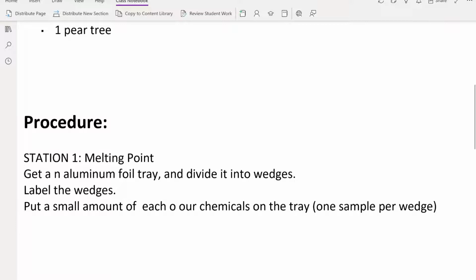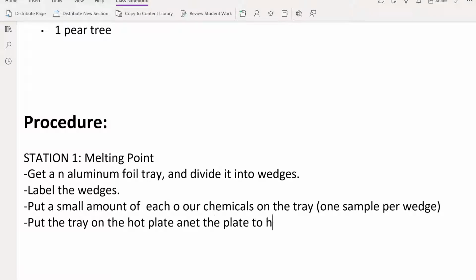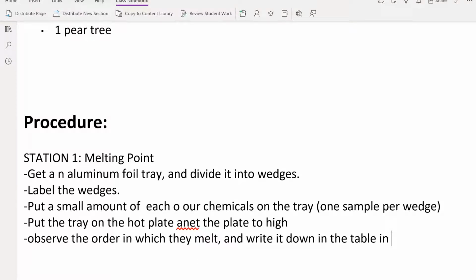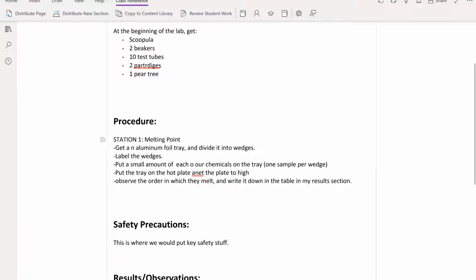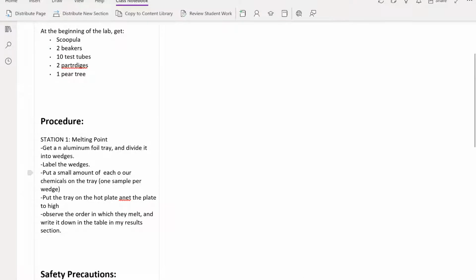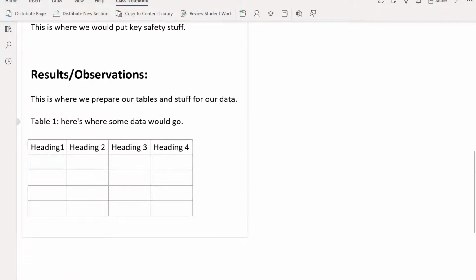And probably I'd put dashes in front of these so I can see it's like point form, right? And then I would say, put the tray on the hot plate and set the plate to high. And then I would observe the order in which they melt and write it down in the table in my results section. So now I've got a good procedure for station 1. But even better, I know that in my results I'm going to need that. So now I can actually say station 1, melting points.